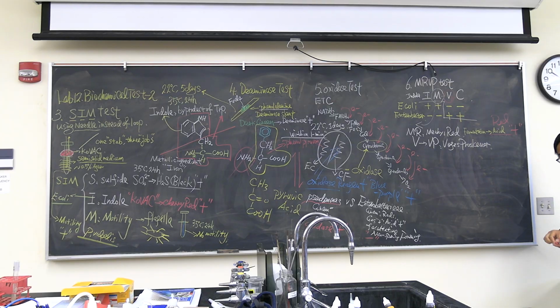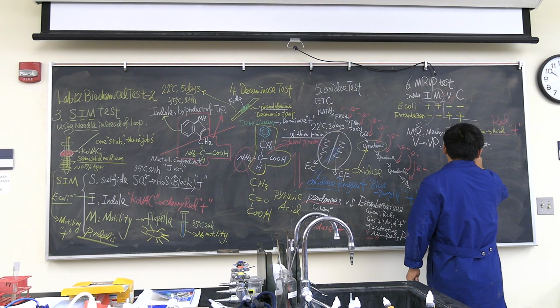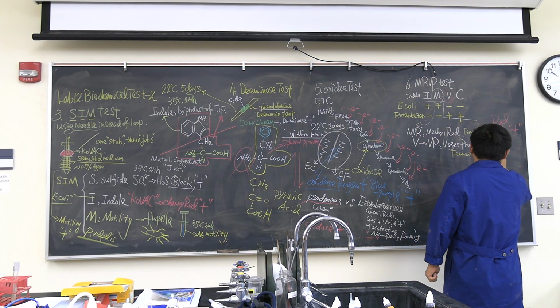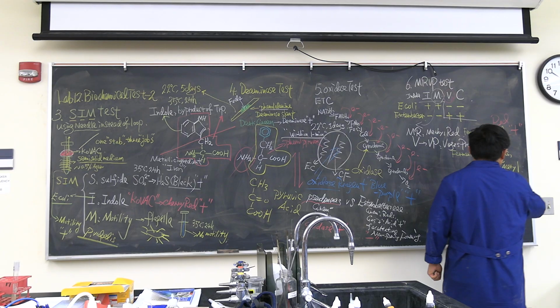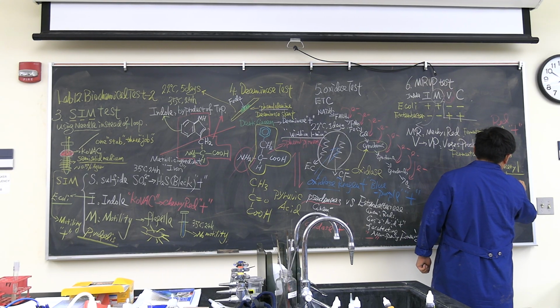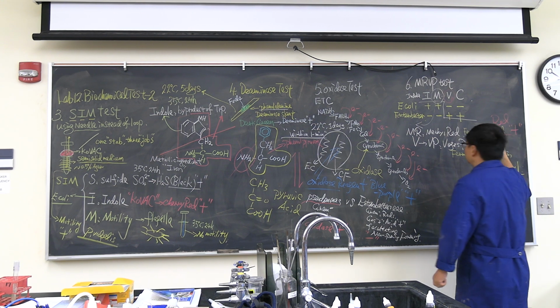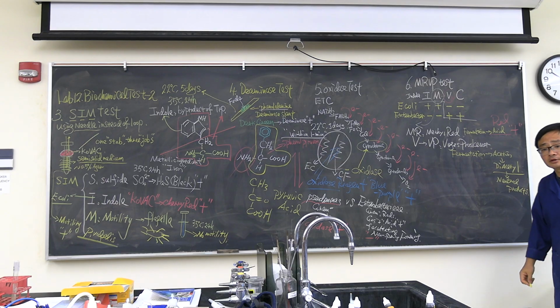Fermentation could generate acid, but fermentation sometimes also generates neutral products. So they first generate acetoin and then become diacetyl. And this is a neutral product, which means it is not an acid product. Remember, bacteria don't always generate acid because acid is harmful for themselves. Sometimes neutral products are good.